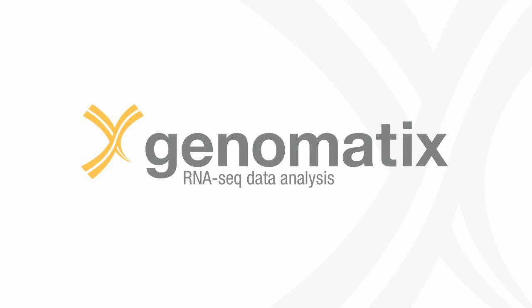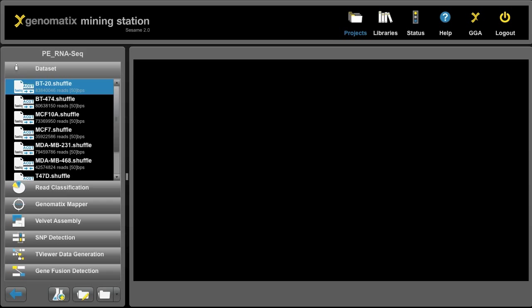This webcast will give you a brief introduction into the analysis of RNA sequencing data. The first thing I want to show you is an RNA sequencing project on the Genomatics Mining Station.